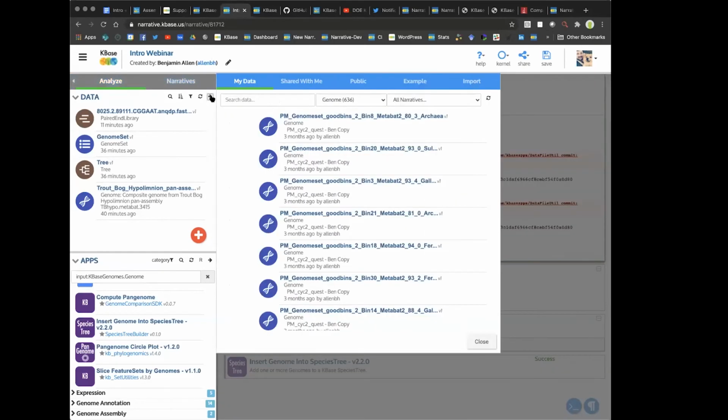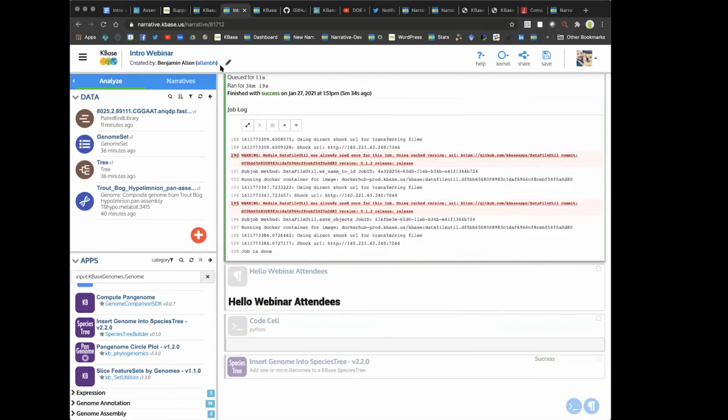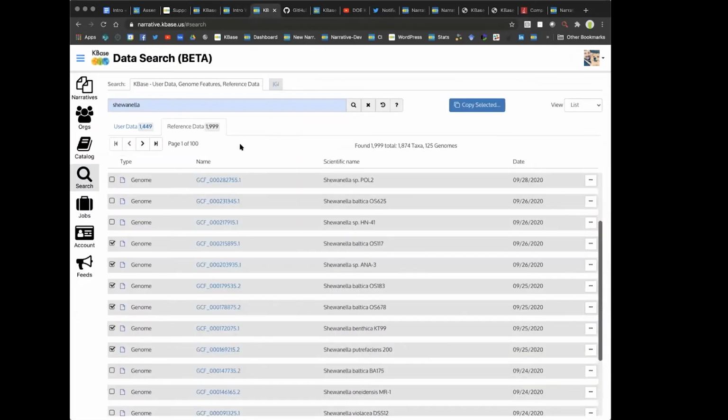than using the public search browser, which, as I said, I won't show because it's under maintenance right now. But there's a little bit of redundancy in the system, which is good. So if the public search tab is down, you can always go to the search tab here and still access the data you're looking for.